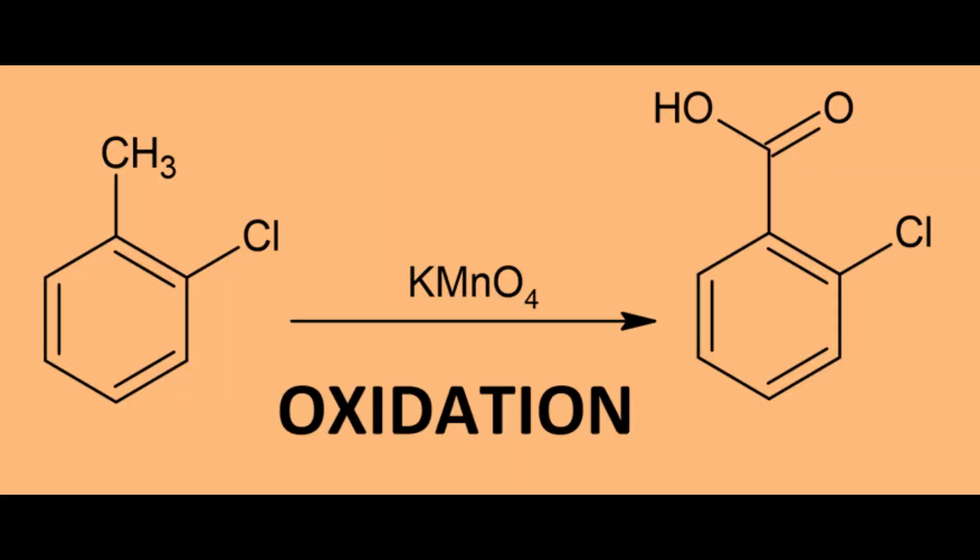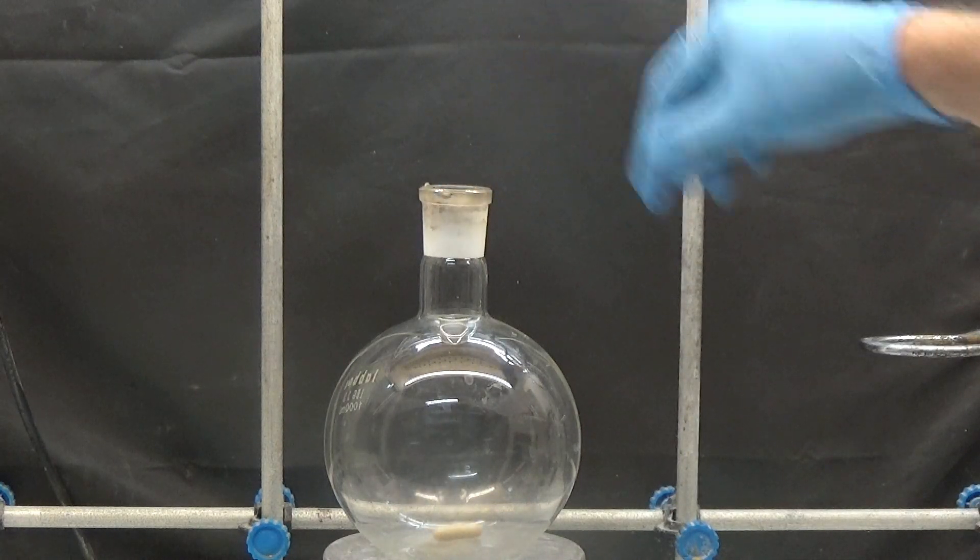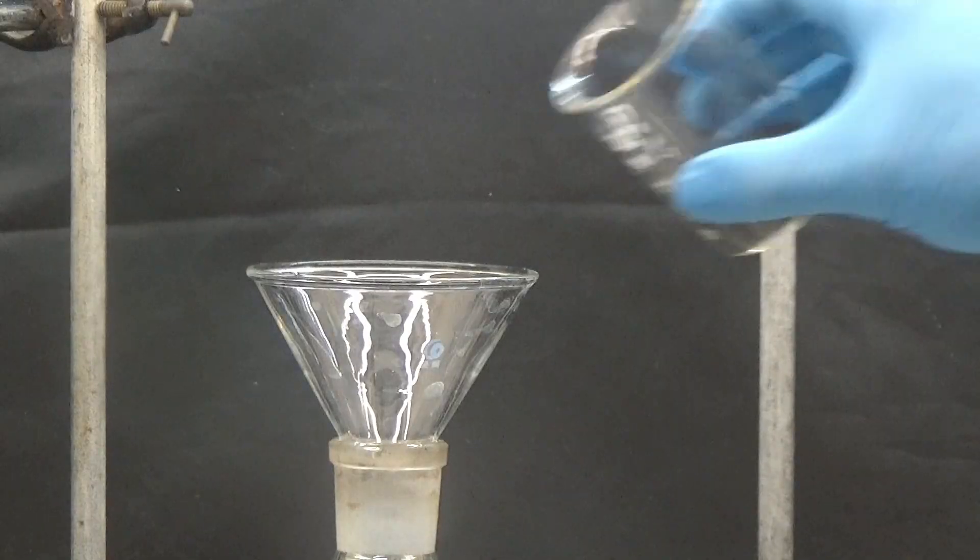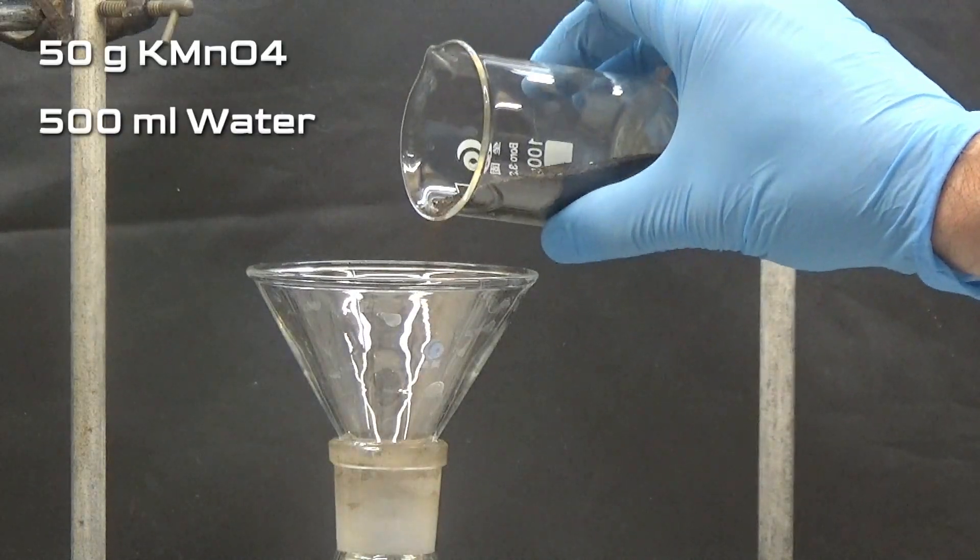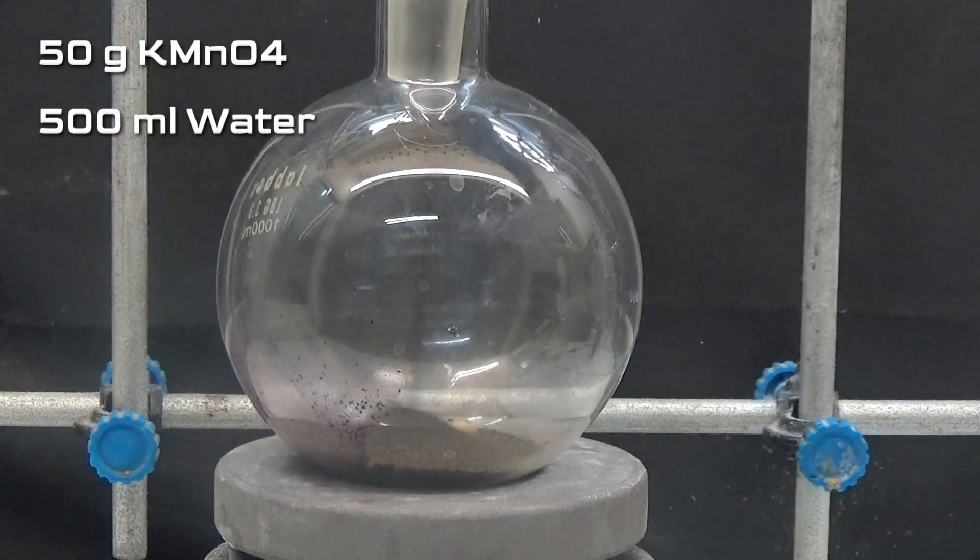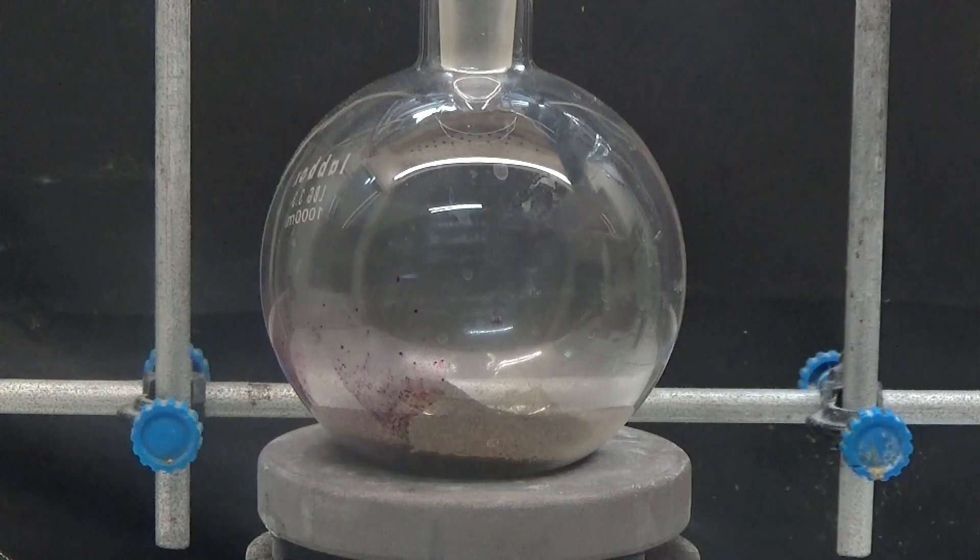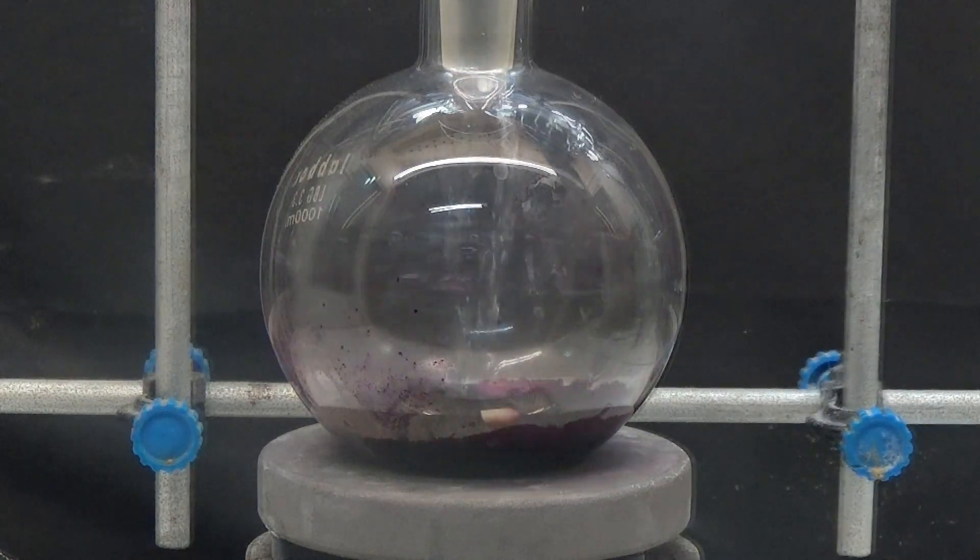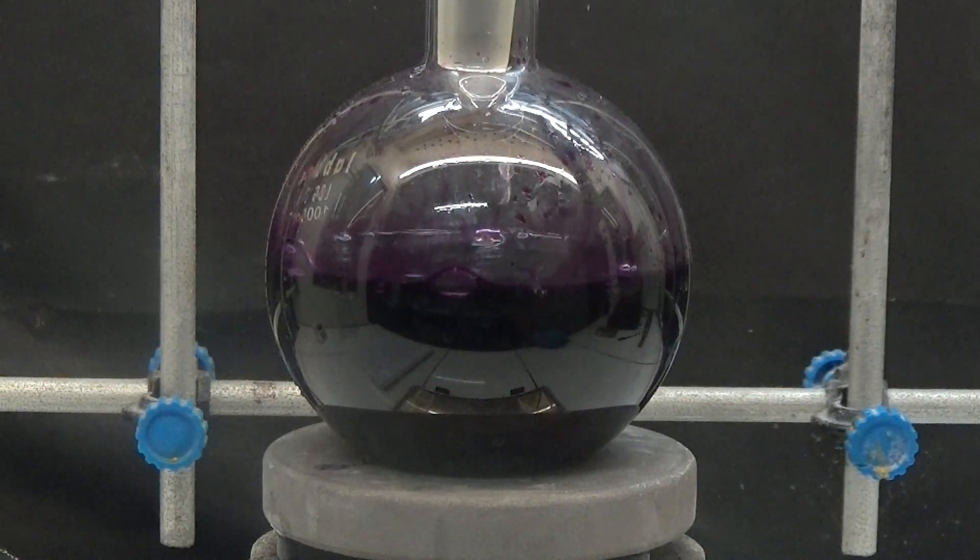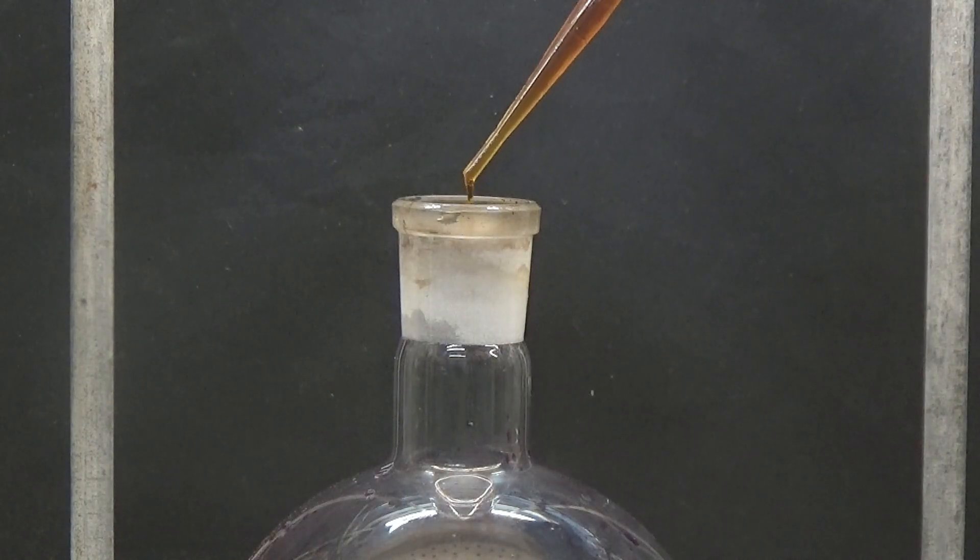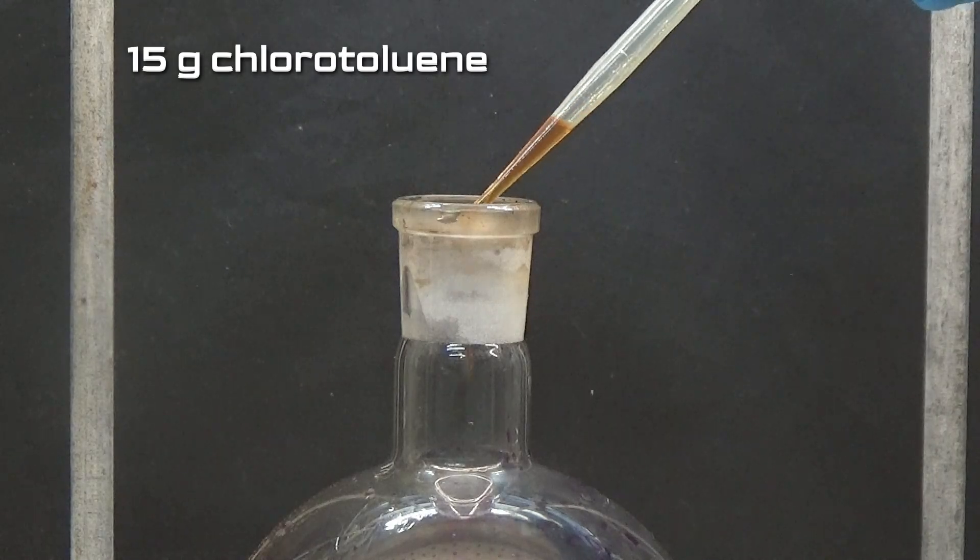In the following process we are going to oxidize the methyl group to carboxyl. For the oxidation we will use potassium permanganate. In a 1000 milliliters flask we put 50 grams of potassium permanganate and 500 milliliters of water. Add slowly and with agitation 15 grams of chlorotoluene.